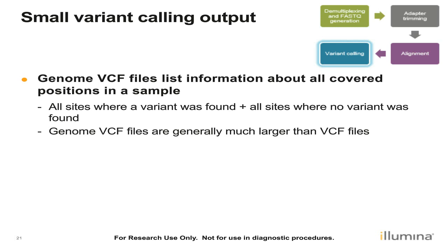And because of this, genome VCF files can get pretty large pretty quickly. So depending on your sample depth and the analysis type, these can range in size. They can get into the many gigabyte size of files. So just something to keep in mind. And we'll take a look at what the genome VCF format looks like.